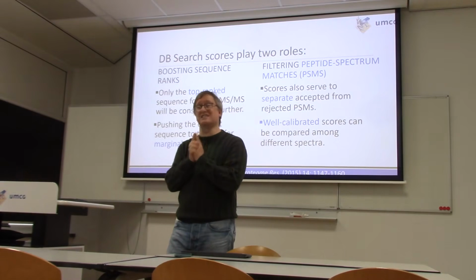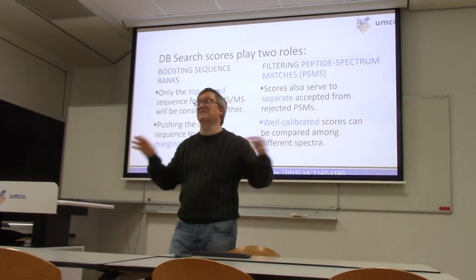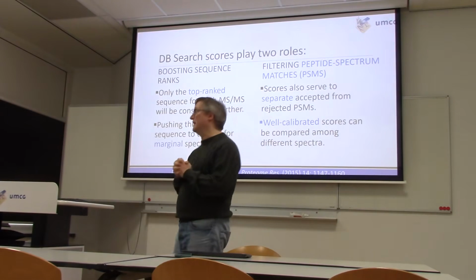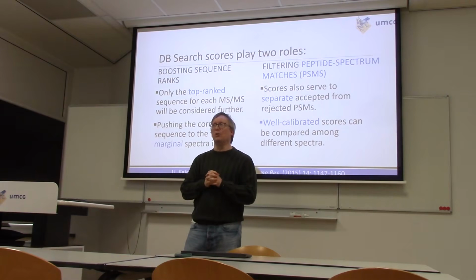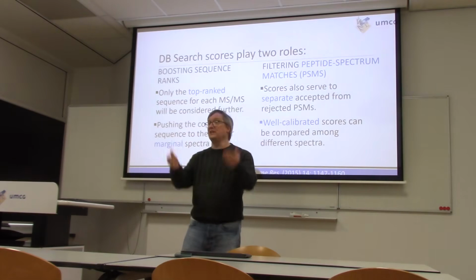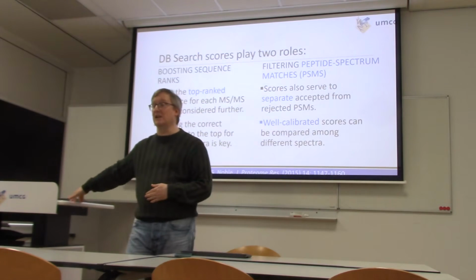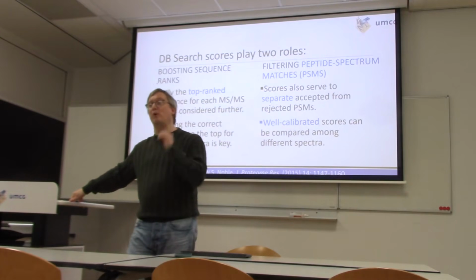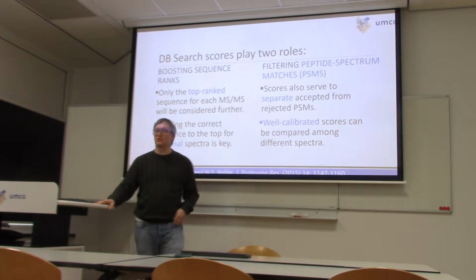This talk is going to necessarily be pretty superficial because there are a lot of pieces to all of this that can complicate the story. But I hope that we can talk about what we do with those PSMs to find a confident set, how we make protein inferences that explain the existence of these peptides in our mixes, and how we can go about quantifying them. But let's start with those search scores.